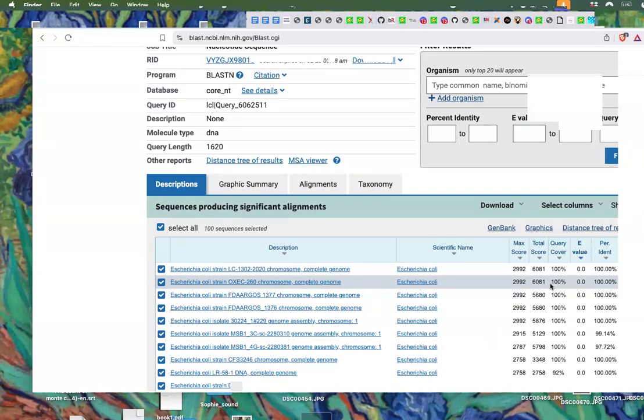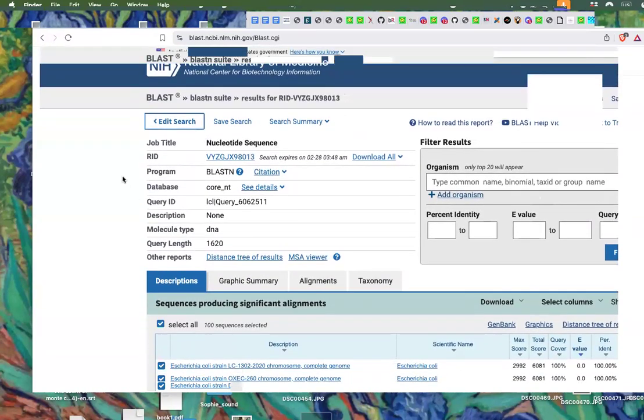So this is an experiment which is a resequencing of E. coli. And we've seen that with the assembly strategy, we can just assemble everything, then use BLAST to find which is the sequence that corresponds to it. It would be more difficult with the reads, because the reads can be too small, they will actually match multiple species, they can have errors, etc. So doing the assembly first allows us to do it nicely.